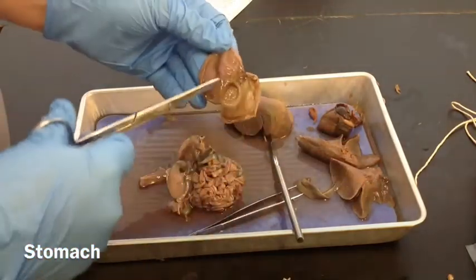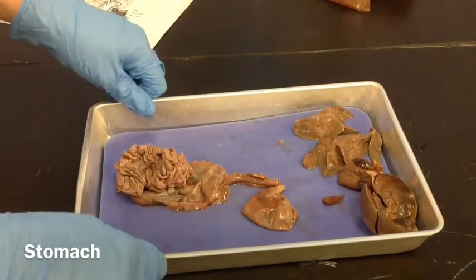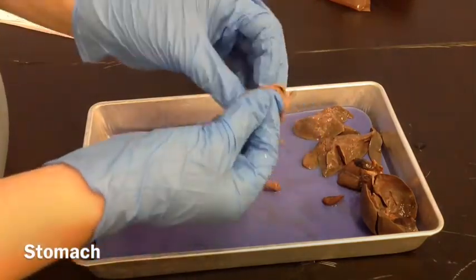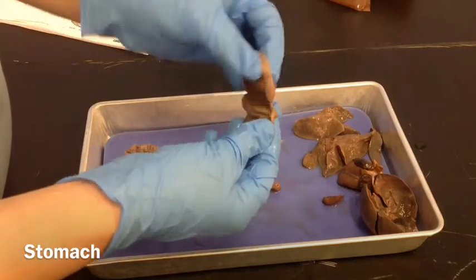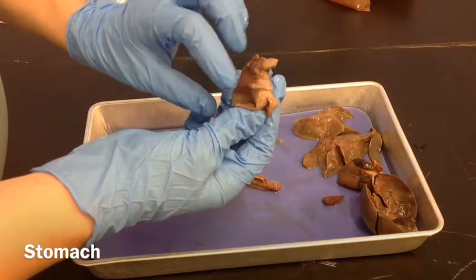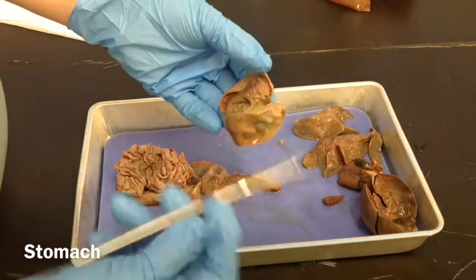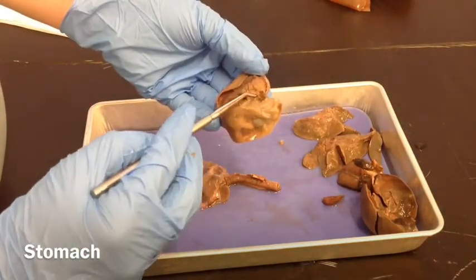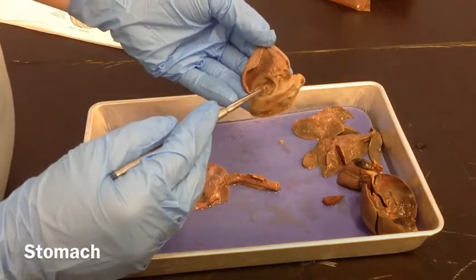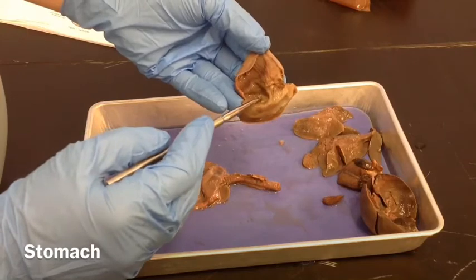You can see that it's got some rugae. Once you've cut the stomach open, you can see on the inside the two sphincters — where the esophagus connects to the stomach and where the small intestines begin. On the inside we can see: this is the cardiac sphincter, this is where the esophagus comes into the stomach, and this is the pyloric sphincter — this is where the small intestines begin.